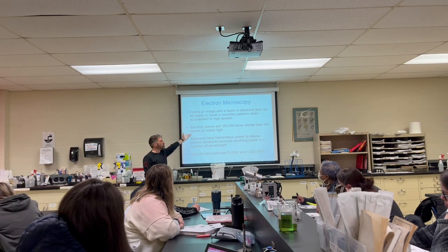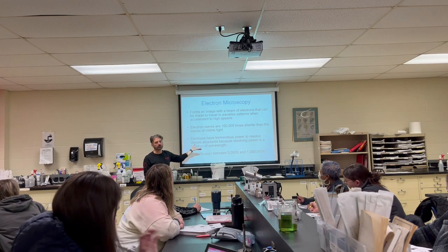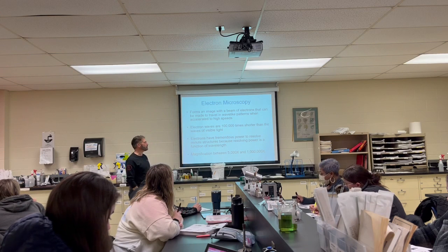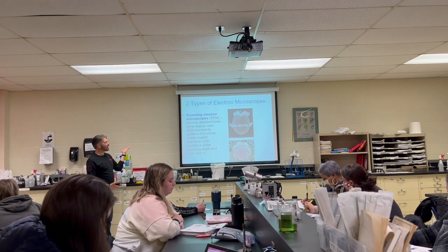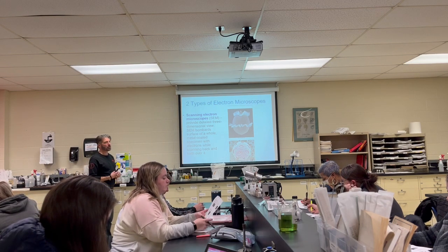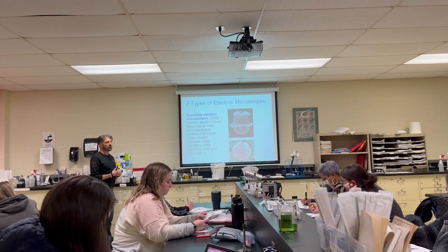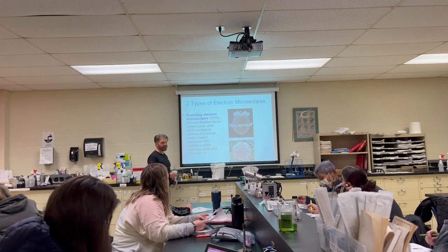Magnification is between 5,000 and a million, so much, much better. And there's the scanning electron microscope, which gives you really good, super cool details. You guys probably don't think that's exciting, but I nerd out. I love this stuff.